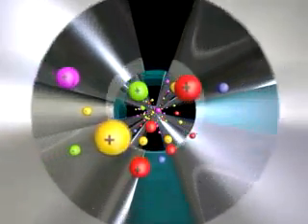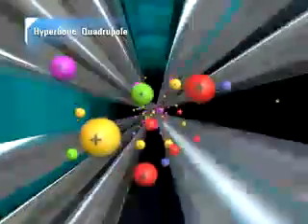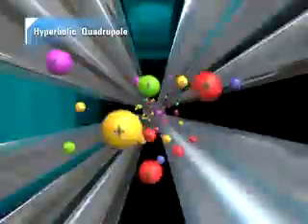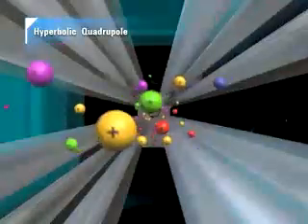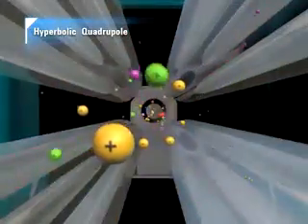The analyte ions leaving the ORS cell enter the quadrupole mass filter and are separated based on their mass to charge ratio. Only the target ion is stable and passes along the axis of the quadrupole. The quadrupole scans rapidly across the mass range and passes each mass of interest sequentially to the electron multiplier detector.